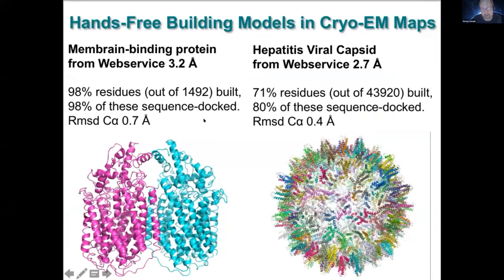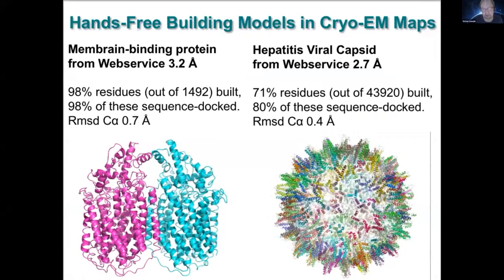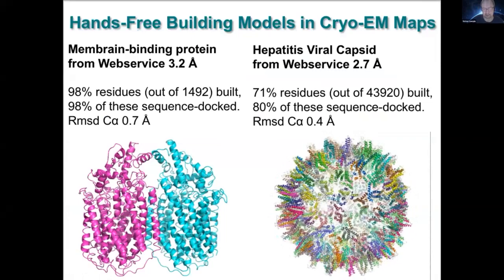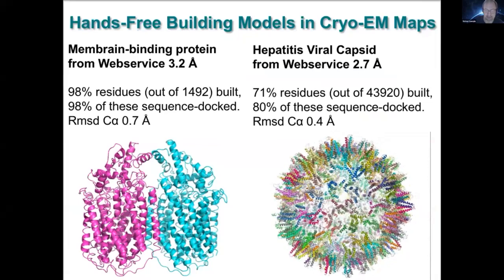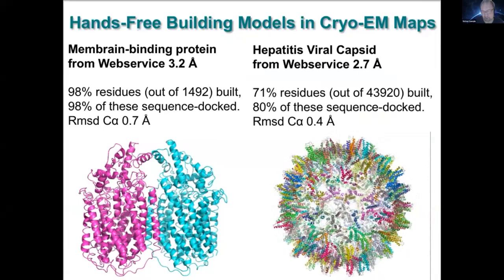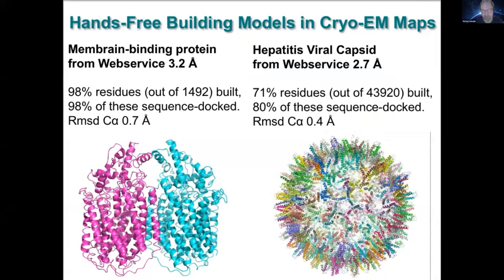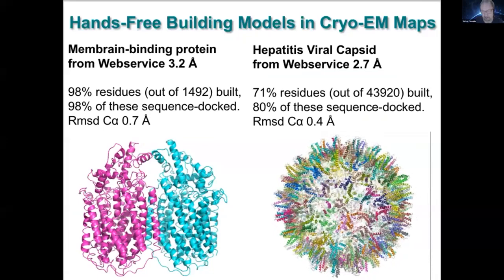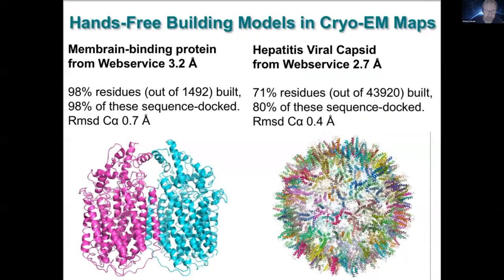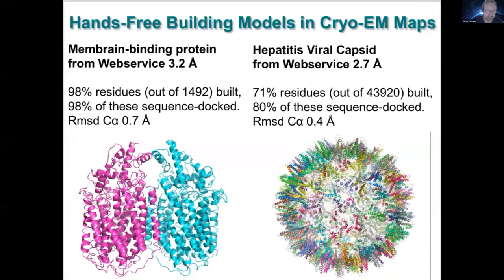I should say that, as we judge from the web service, it's probably 5% of the job submissions which are for cryo-electron microscopy. The vast majority is for X-ray crystallographic model building, and of those, probably more than 90% start from a model, molecular replacement, or maybe predicted with AlphaFold or related software, and a smaller part with experimental phasing.